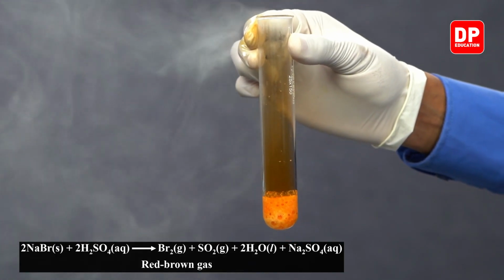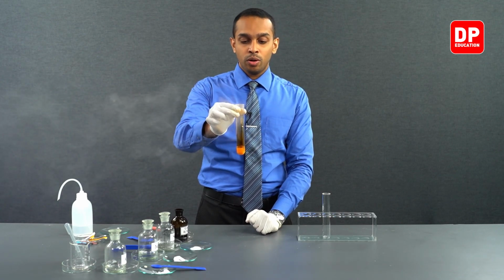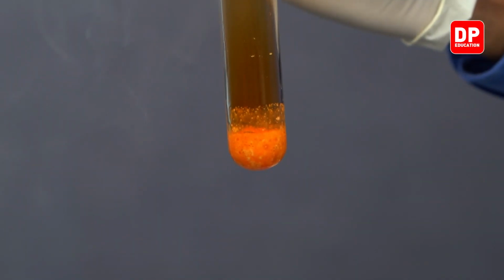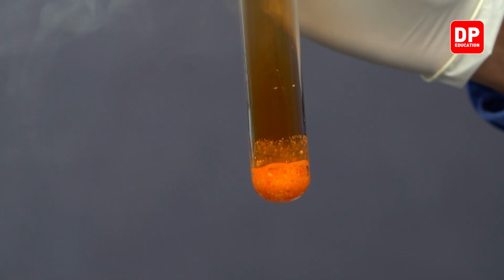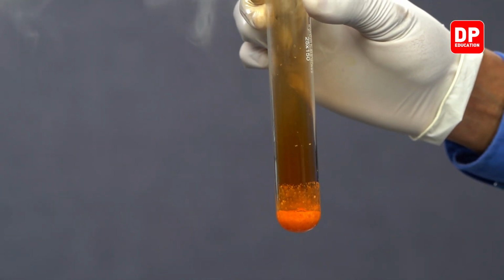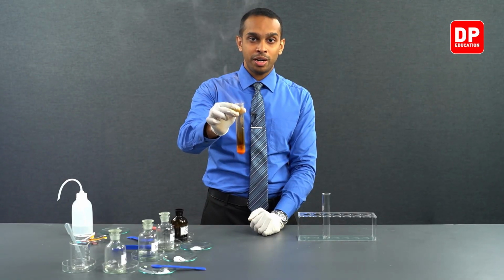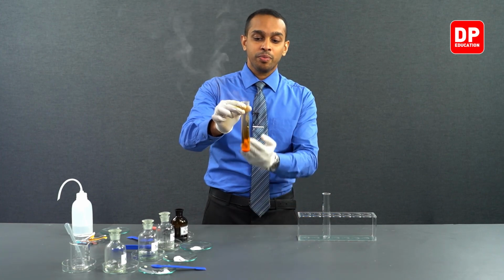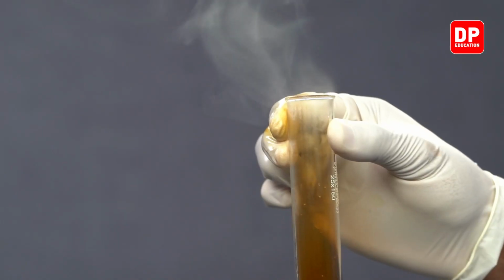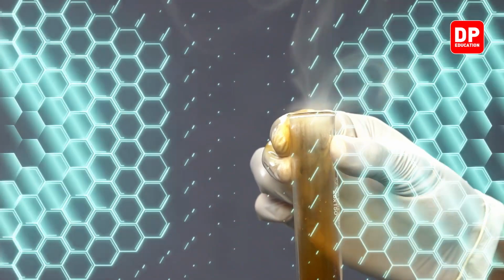In the presence of concentrated sulfuric acid, the bromide ions in sodium bromide will be converted into bromine gas, which now is evolving as an orange or red-brown color gas. Now we'll have to remove this sample from the lab.